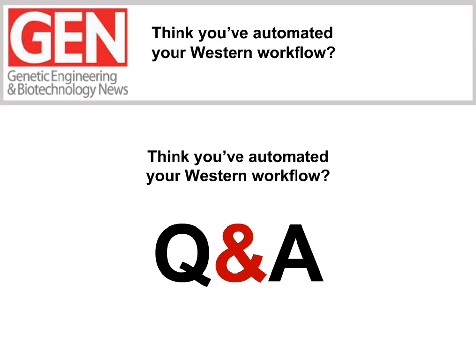All right, another one for you. What percent of antibodies that have worked with traditional Western have you seen not work with the Wes? So with all antibodies, some will work for some applications and they won't work with others. I think we'd all love antibodies that work for everything. So we did do a very in-depth study when building the instrument to have an idea what percentage of antibodies that worked on a traditional Western would also work on Wes. And we found about 80-90% did transfer over well.